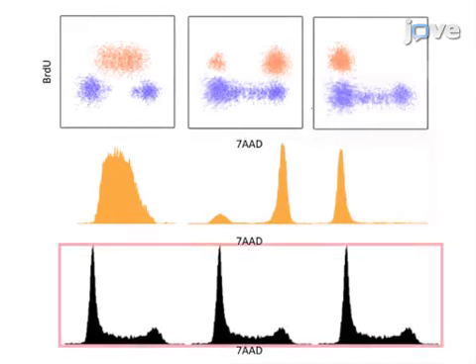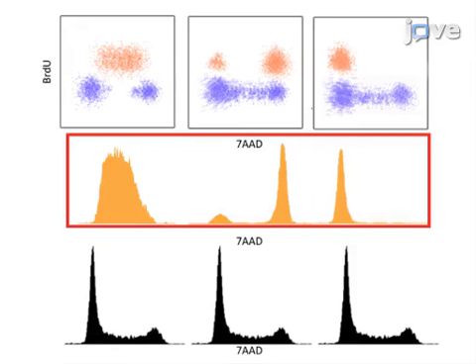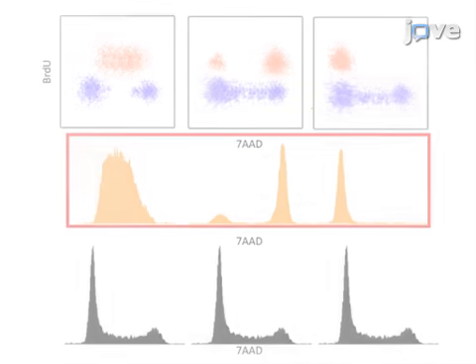Results obtained show the DNA content as a marker of cell cycle status for the whole population and for the cells that were in S phase during the BrdU pulse. This latter population functions as a synchronized population that can be tracked during the remainder of the cell cycle and into the next round of cell division. The main advantage of this technique over existing methods, such as chemical blockade, is that it does not disrupt the natural cycling of the cells and limits the amount of cell death in the synchronized population.